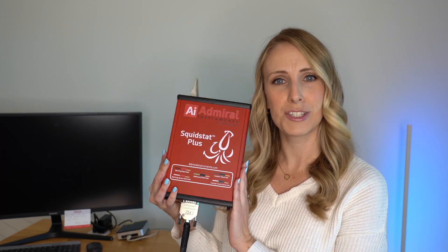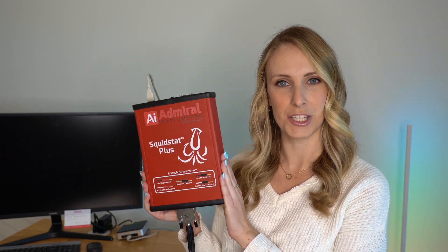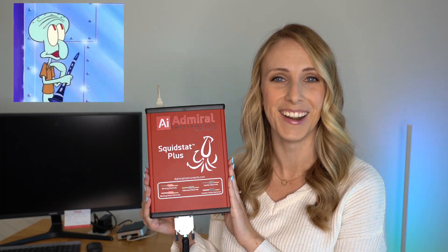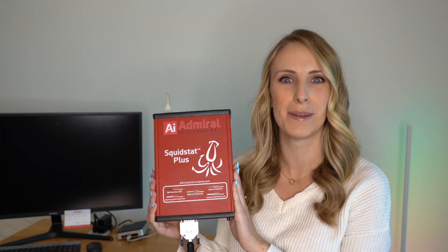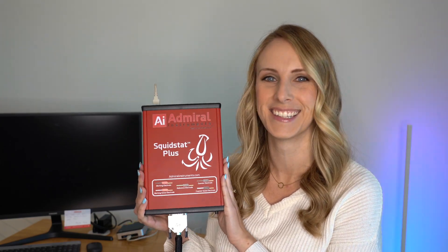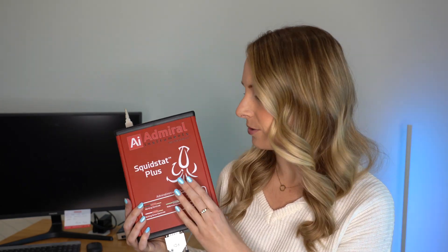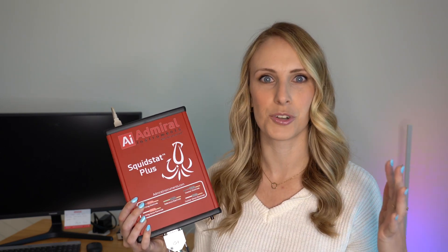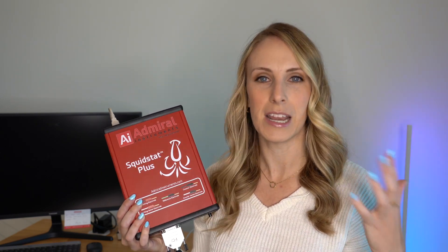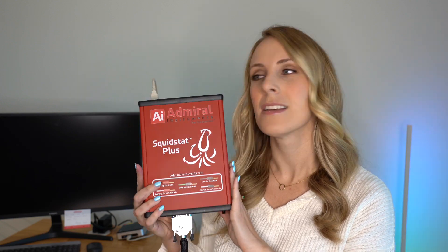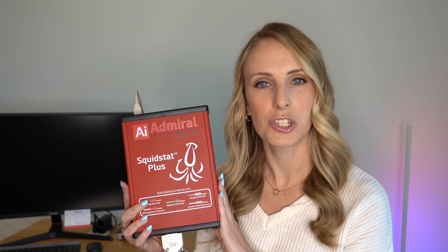For now, I will be demonstrating how to perform CV and LSV with some crucial tips on this Admiral Instruments Squidstat Plus Potentiostat. Here at Electric Goddess we named ours Squidward because we are Spongebob fans here. At least I am and my co-workers who named this. I just love how it has this super cute squid logo on it and yet it's a research grade instrument that we use here in our lab. Science can be cute and extremely reliable and functional.